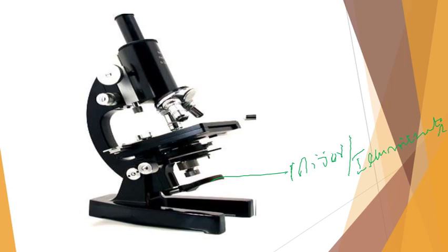This is the illuminating part. In addition to this we have a condenser. This is also an illuminating part of the microscope.